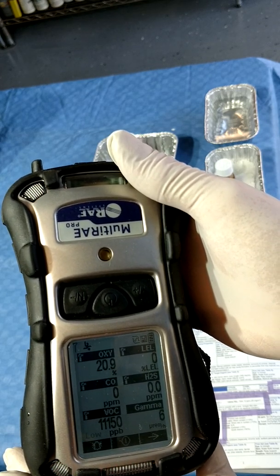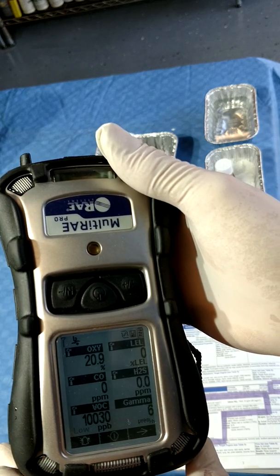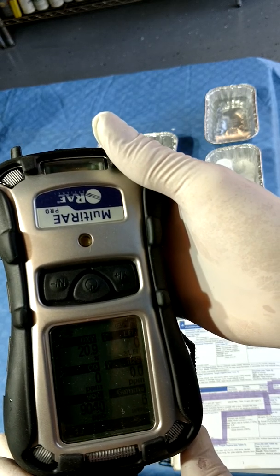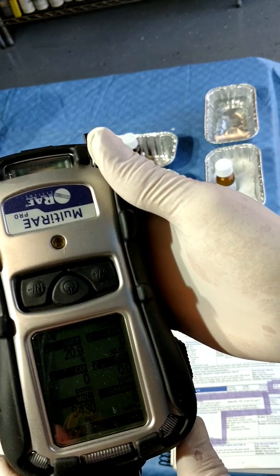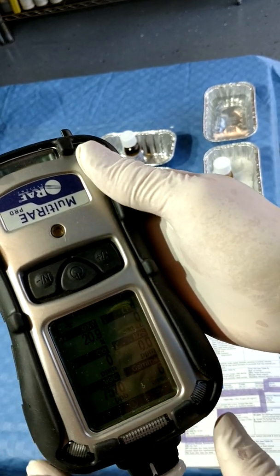So to conclude, we can see the changes on our readings from weak versus strong acid strength and corrected versus uncorrected sensors. Now I'll return the sensors to their normal calibration measurement gas to bring the meter back to uncorrected mode. Hope you enjoyed the video.